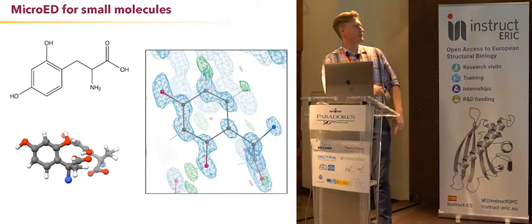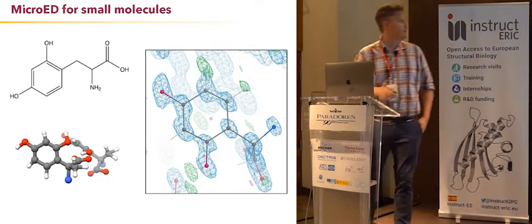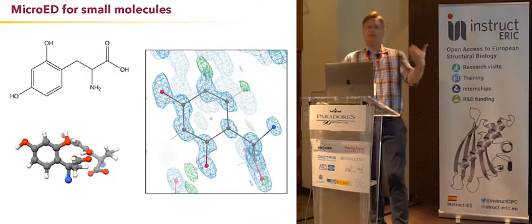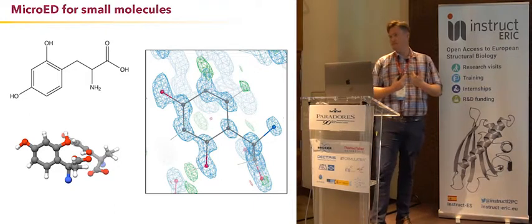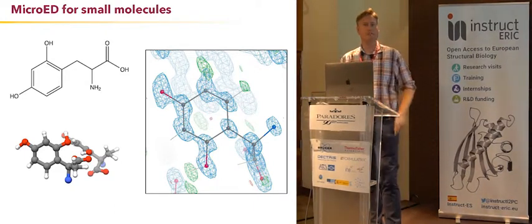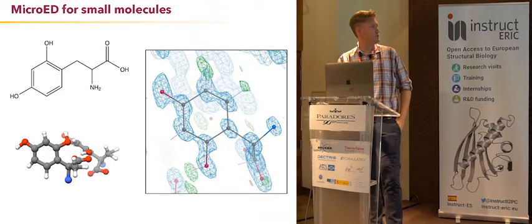So after taking this, we got rid of all the carbons here and put the right elements in. And when we solved it, it looked like both enantiomers were in the same unit cell. And then they did some tests and found out, yeah, sure enough, they had this sort of racemic mixture. So it was kind of a cool little project.